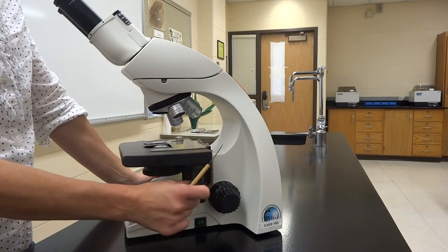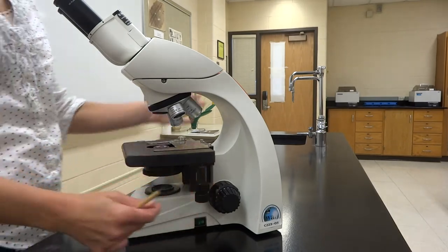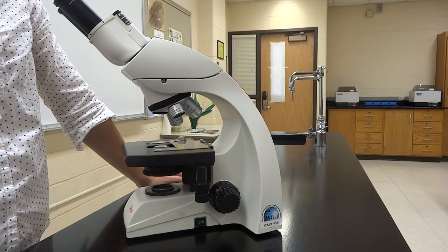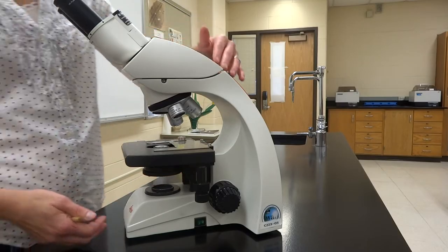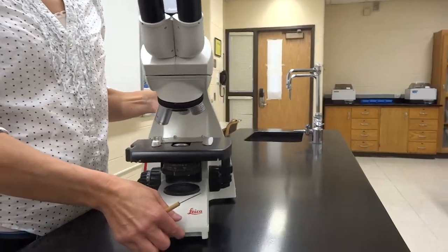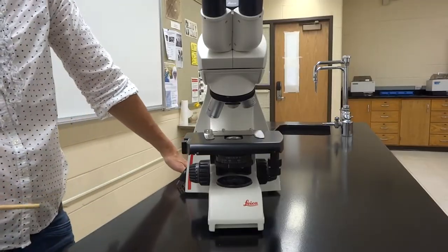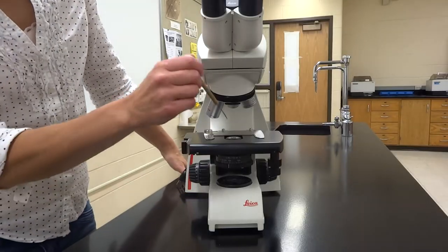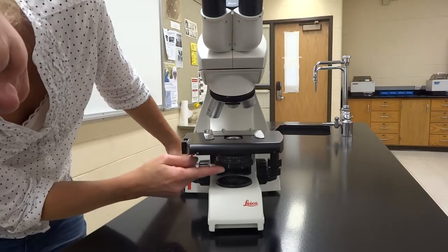The mechanical stage control moves the stage forwards and backwards, helping you get your specimen underneath the light. That light is focused straight up through the condenser. If you look from the straight-on view, you can see that the condenser lens is the actual piece the light focuses up onto.